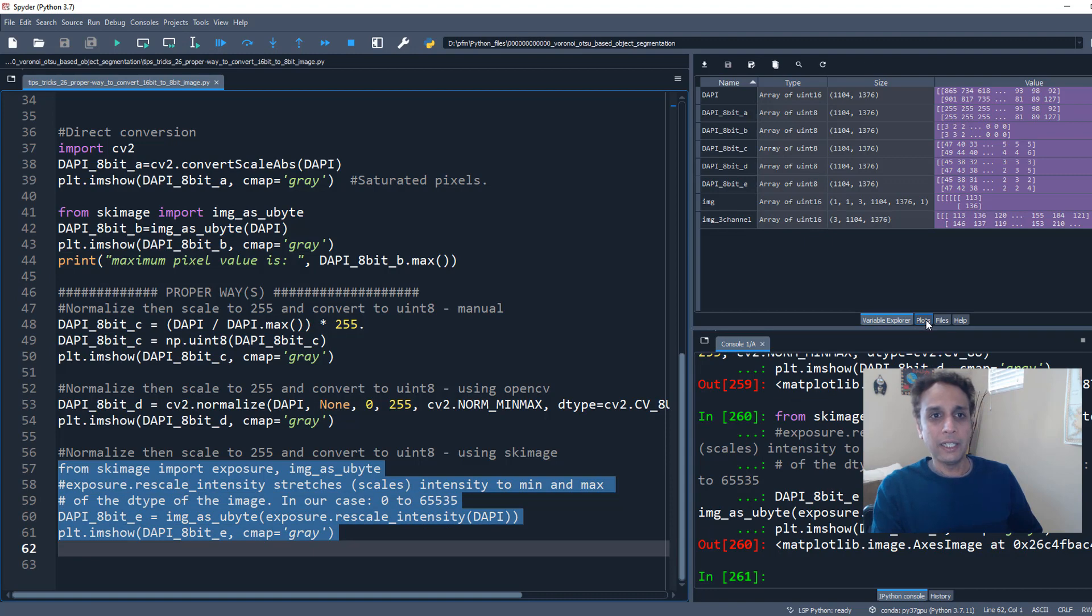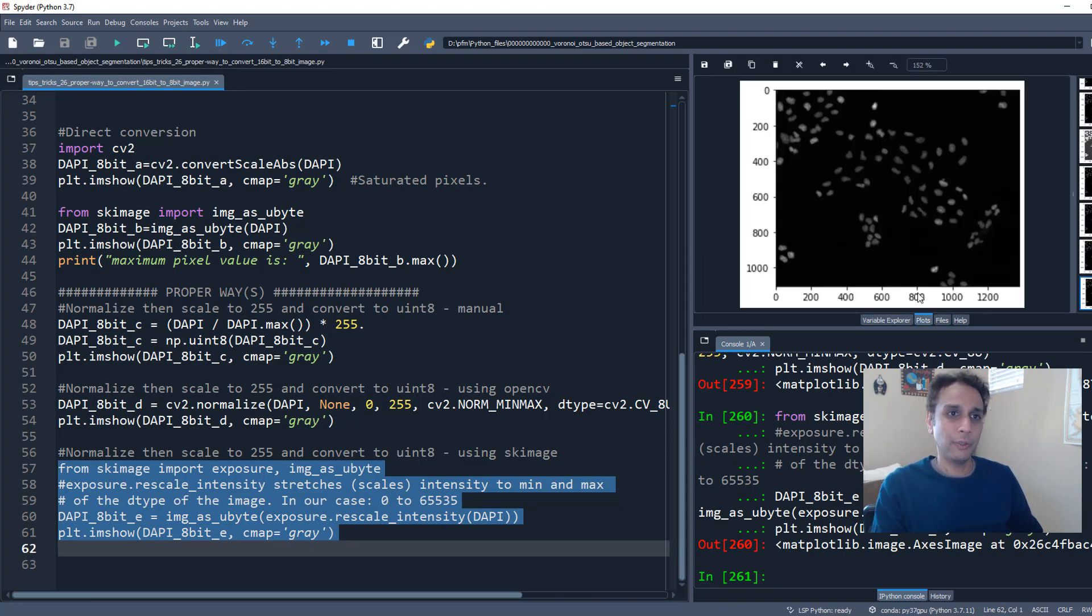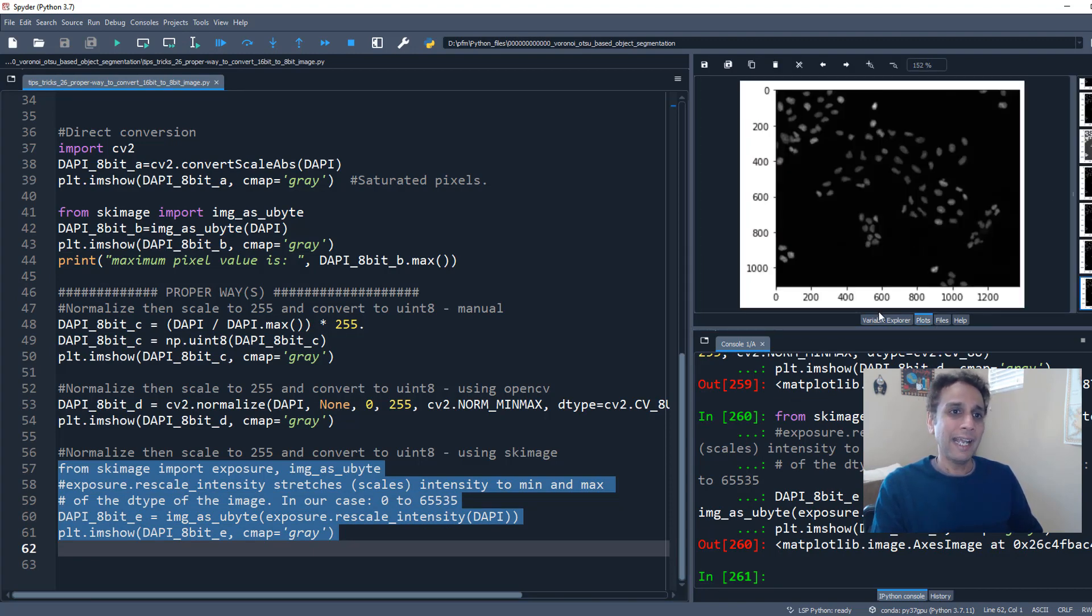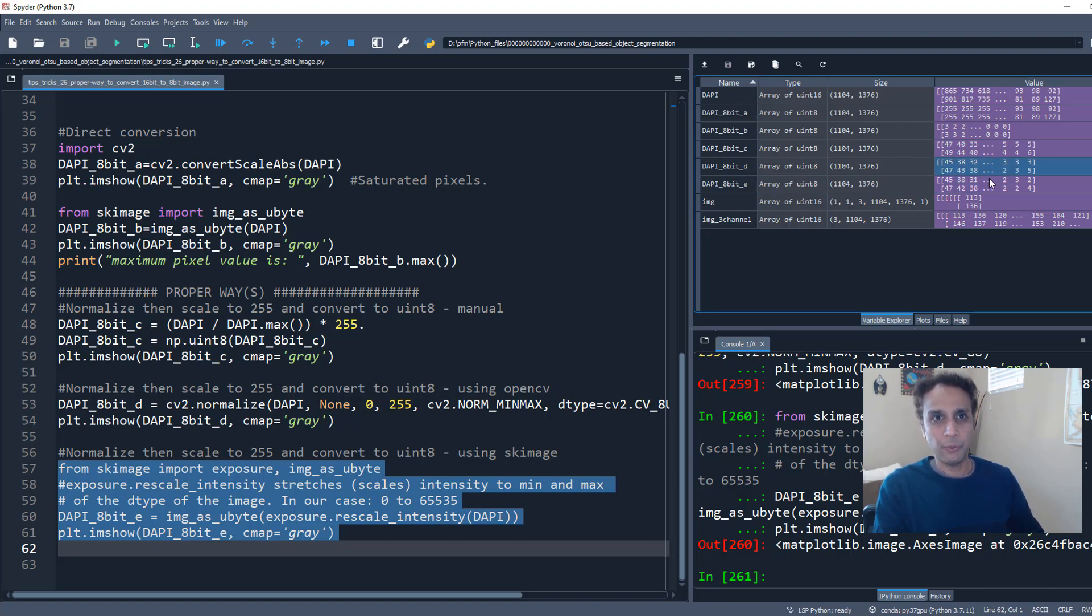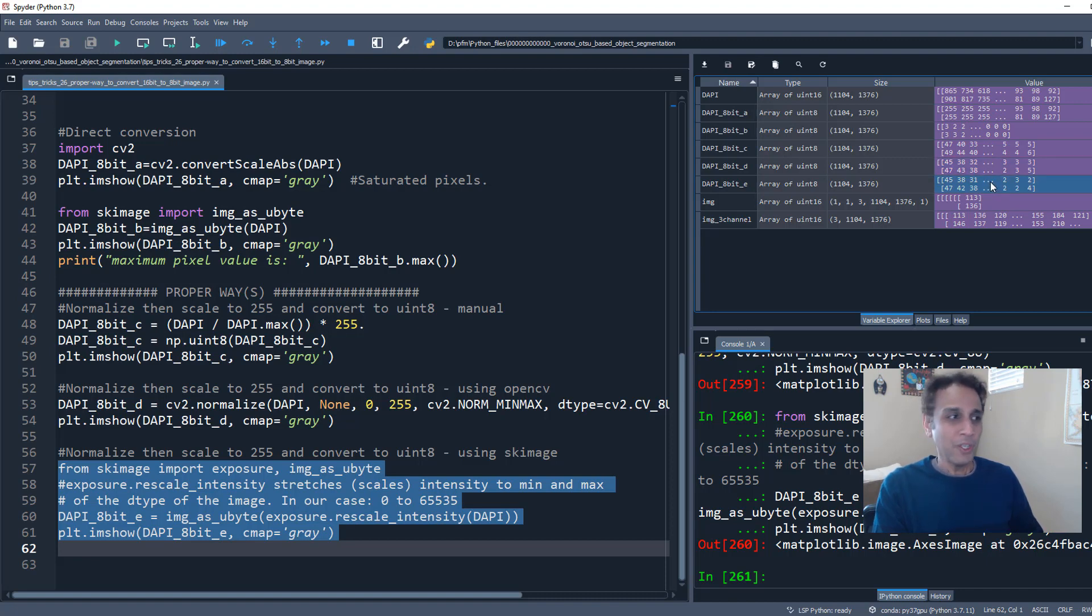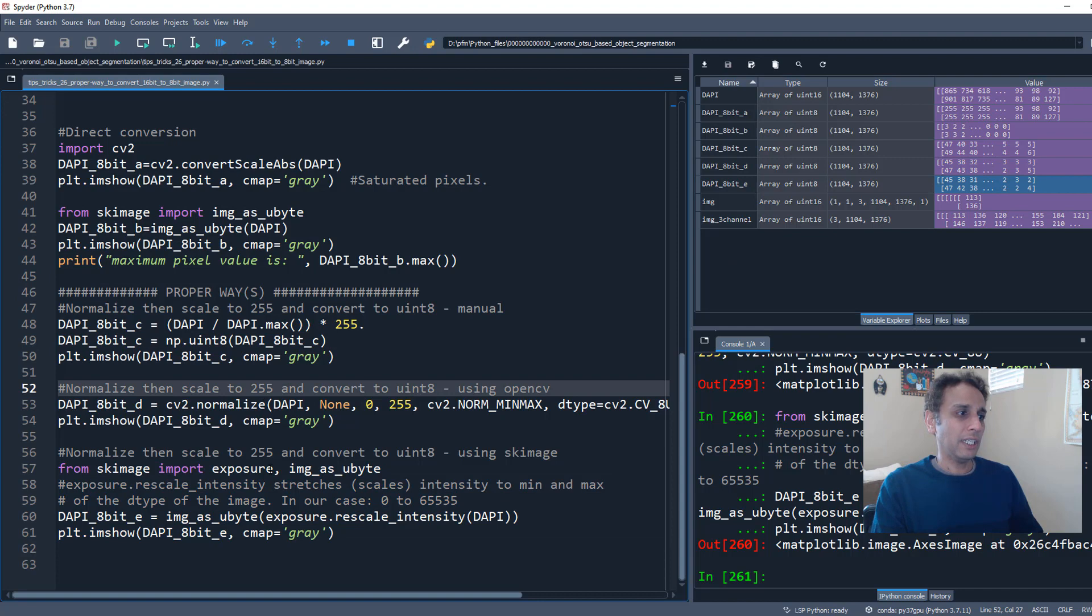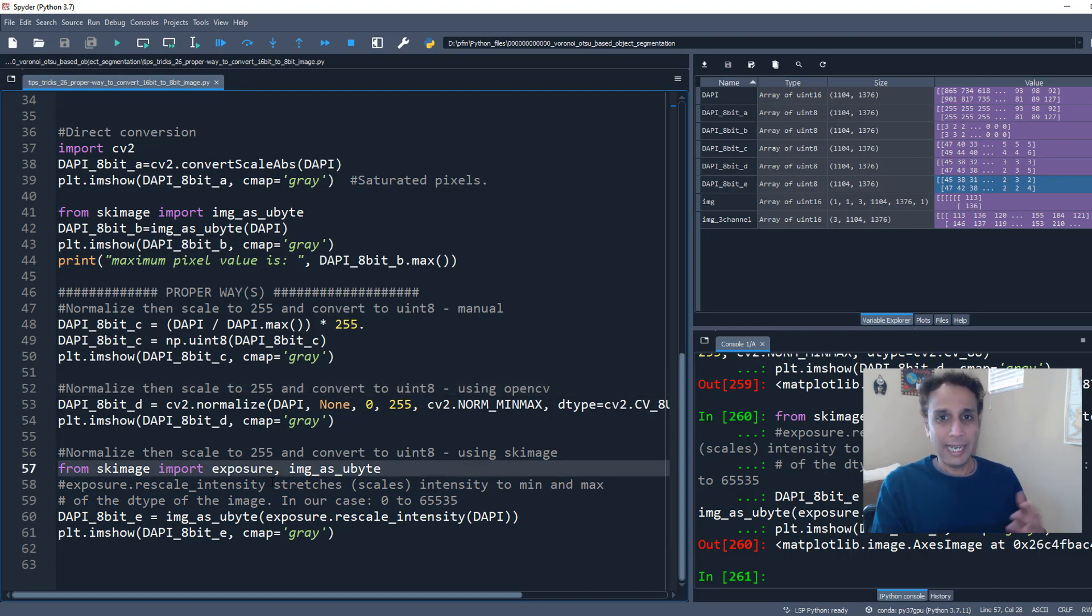And look at the plot. That looks identical to the one before. And also look at the values here. The value for this, 45, 38, 31, almost identical to OpenCV. There will be some rounding off issues between these, but these two are almost identical, as you can see. So any of these three is okay, acceptable, and just be aware of these.